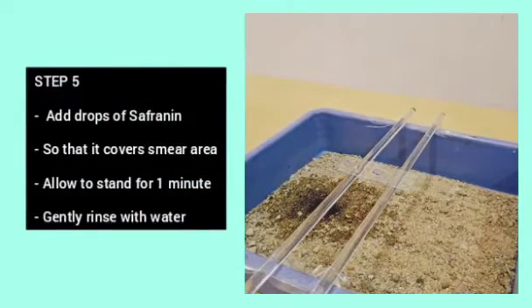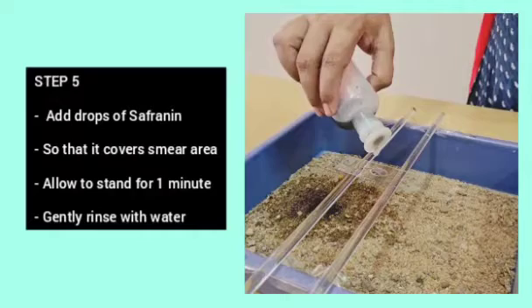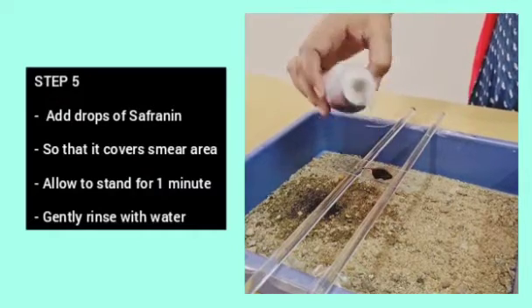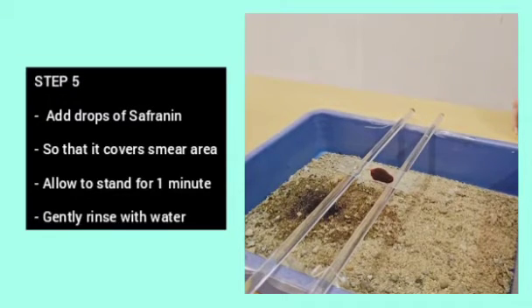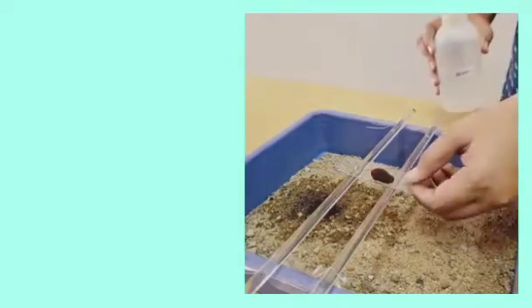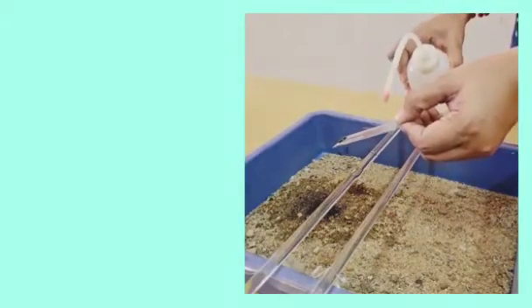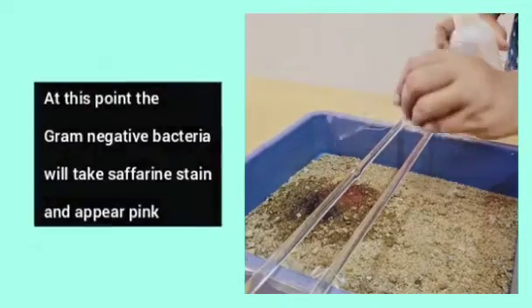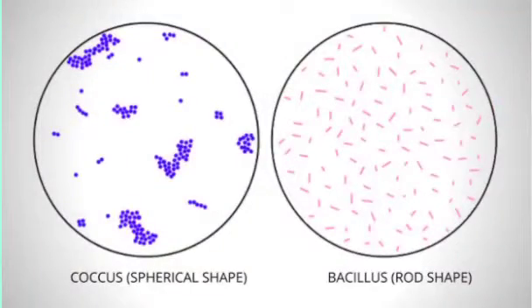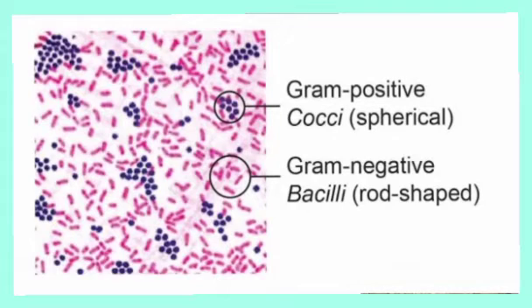Step 5. Now, add drops of saffronin which is the counter stain or a secondary stain so that it covers the smear area only. Allow it to stand for 1 minute. Gently rinse with water and remove the excess water. At this point, gram negative bacteria will take the saffronin stain and appear pink.